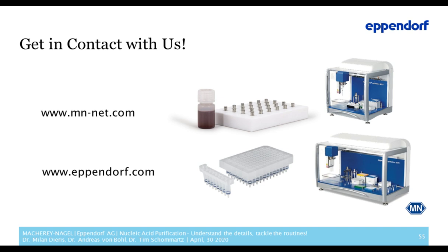So what I mean with partial automation here is that only parts of the entire workflow are automated. You can distinguish basically between the automation of the full workflow, if we take the journey from the sample to the analysis at the end, which can be of different sort. If I refer to partial automation, it's more that within this workflow, there will always be steps which are very tedious, very hard, very repetitive. So if I think about magnetic beads, for example, there will be a lot of washing steps involved, and it might be tricky to handle, especially plates in that background manually. So it might be useful to just automate that one step.